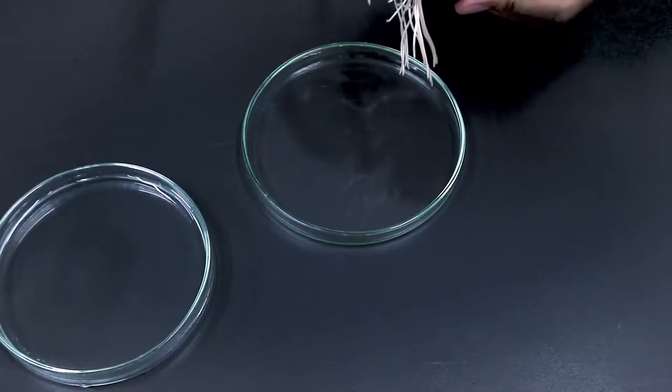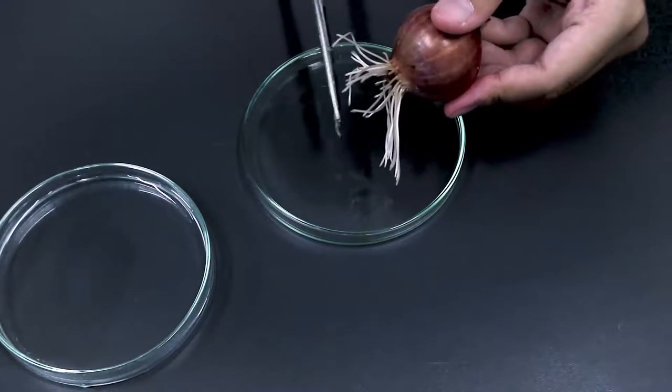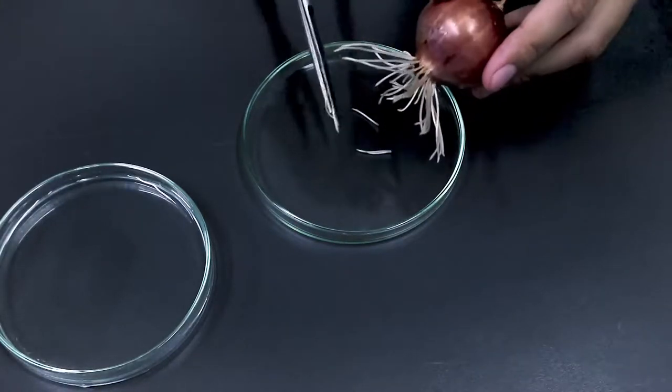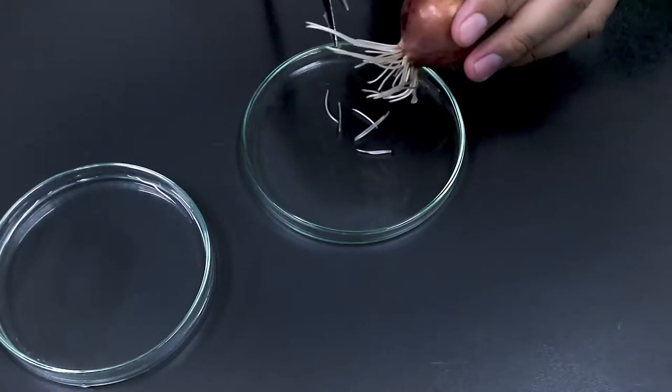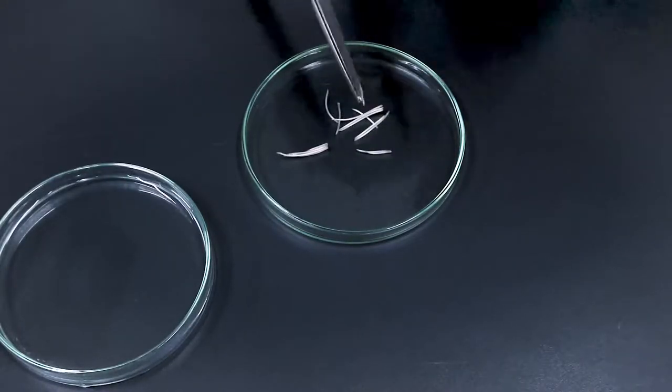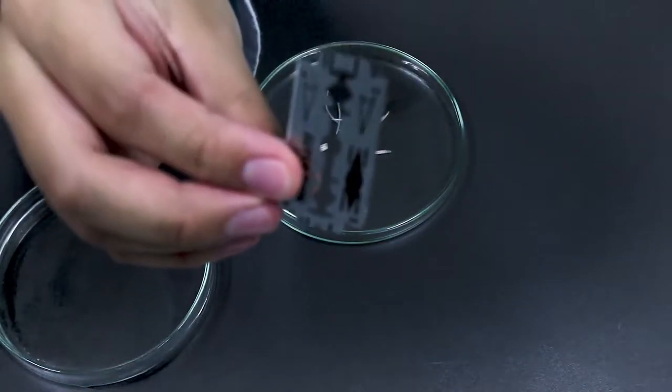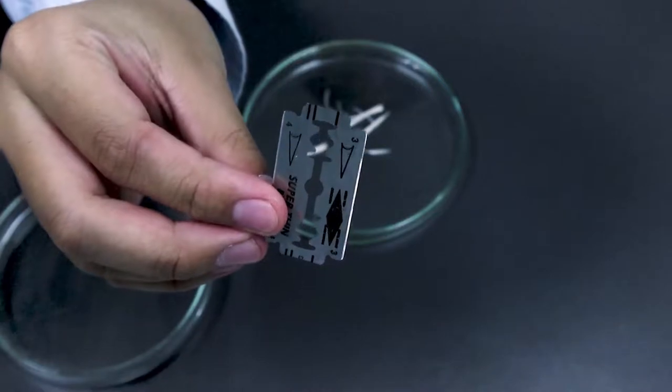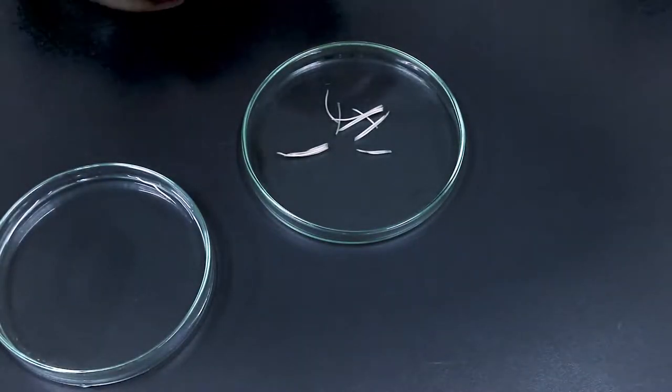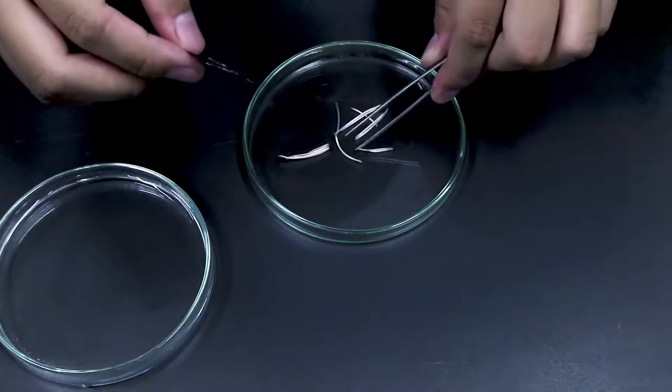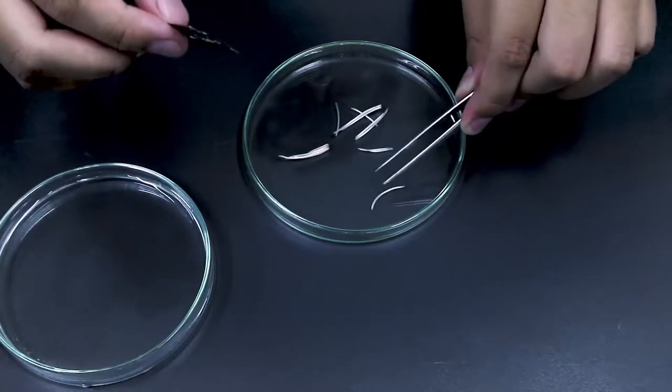You're going to get the root tips from here. Just cut them and place them in the petri dish like this. Be careful to use the correct side or the correct end of the root tips. You can use the razor blade to cut them because as you can see they are too long, so make them shorter. Just cut them.